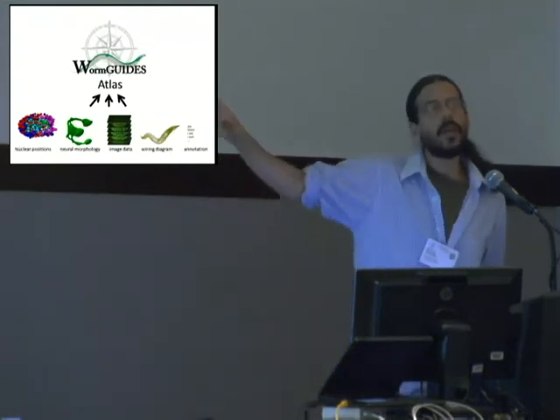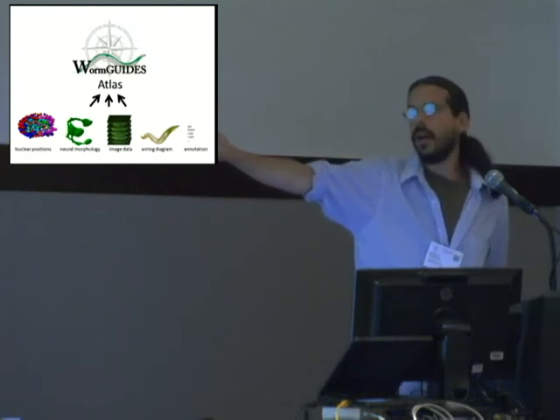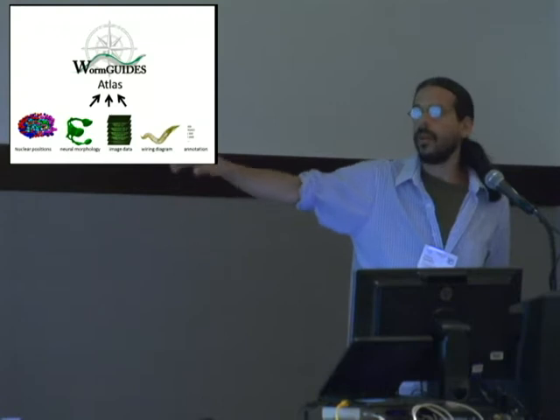So when I'm talking about an atlas, what I mean in this context isn't just a bunch of images, which is what people tend to think of with an atlas, but images that are hung on a scaffolding of more abstracted representations of the embryo.